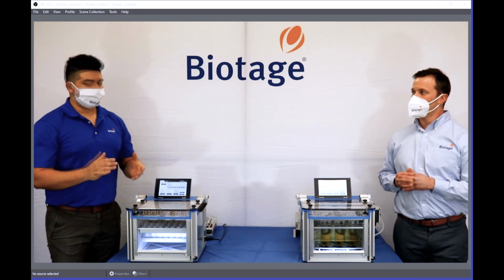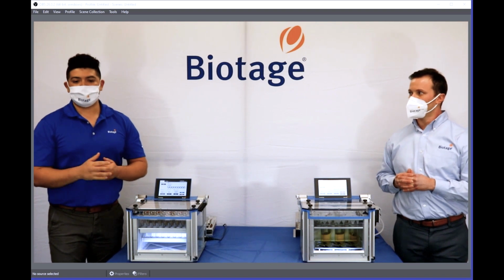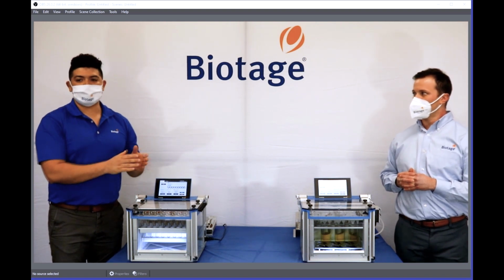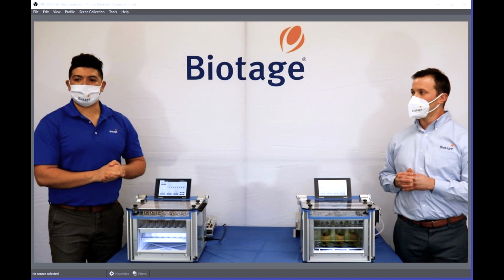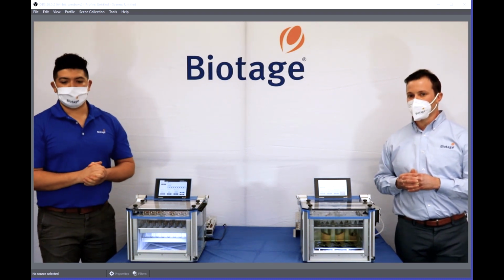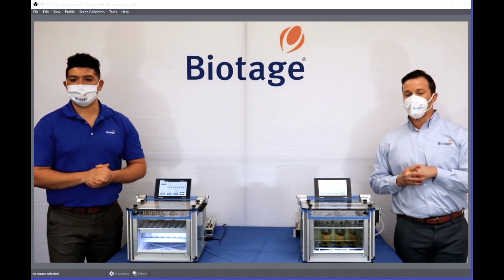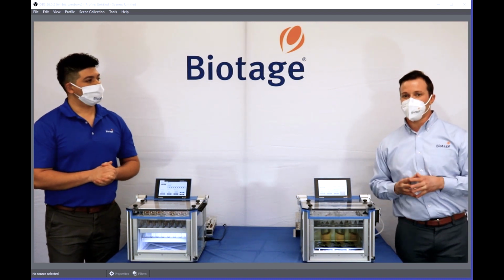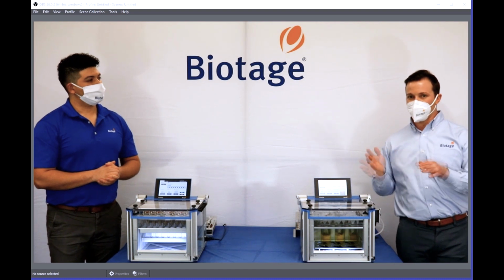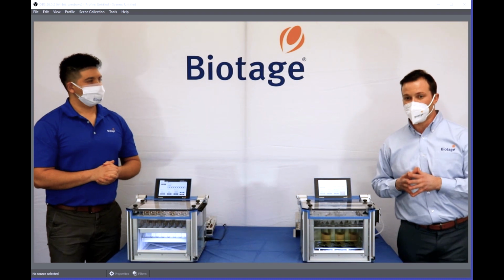And we have a nice little chart that will show you the conversion from PSI to nitrogen flow if you're moving from a classic or an older TurboVap system to the new one. So we can certainly supply you with that information, and it'll make a nice, easy conversion for you. Now, if you're talking about the input PSI, typically for the nitrogen, you're going to need anywhere from 80 to about 120 PSI.